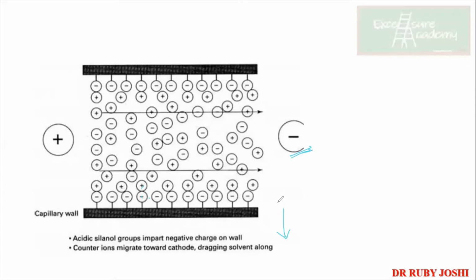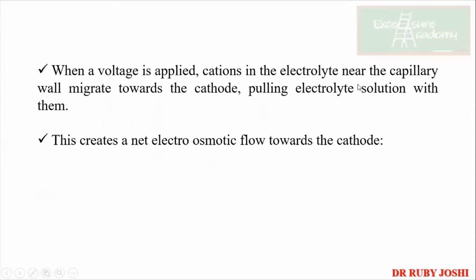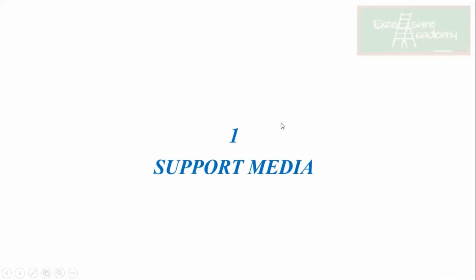Concept clear है? So this is known as electroendo-osmosis. Okay? ये एग्जाम में आया नहीं है अभी तक. Nowadays, anyways, we have got the inert material, so इतना effect नहीं करता है. Okay, so that's all. Not much.